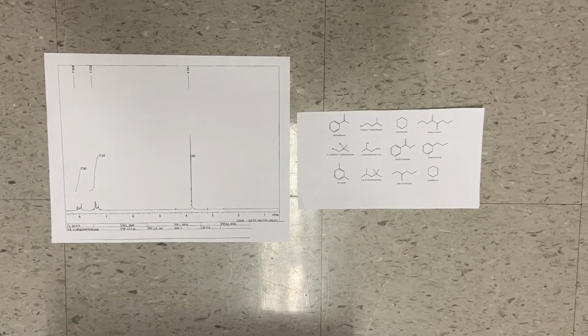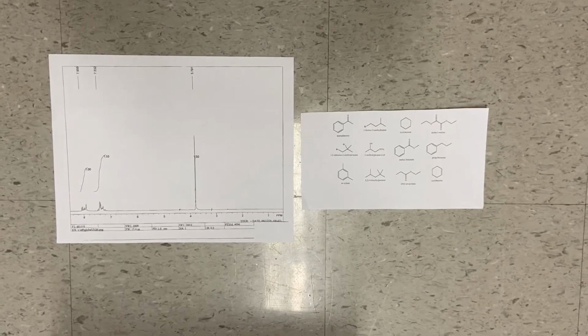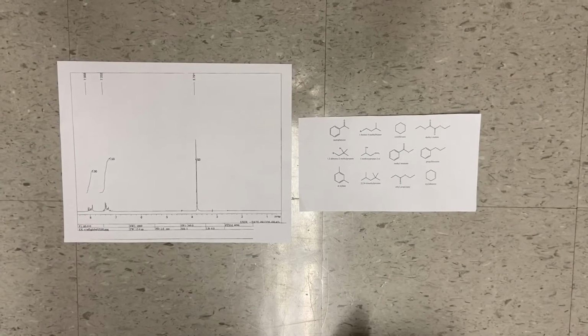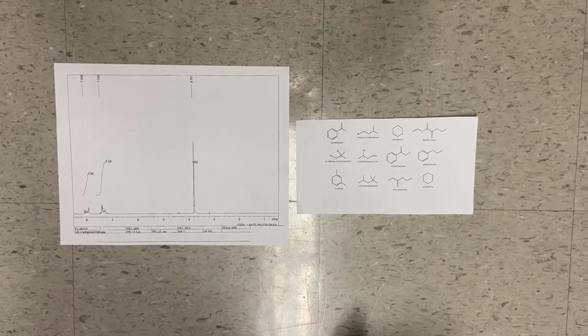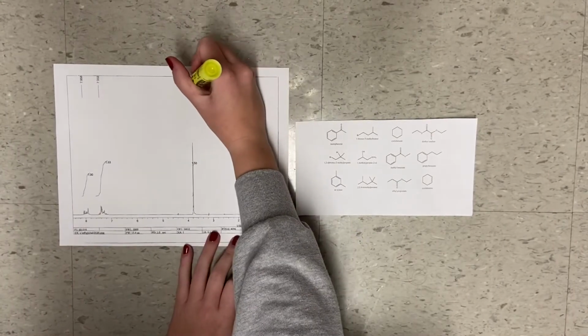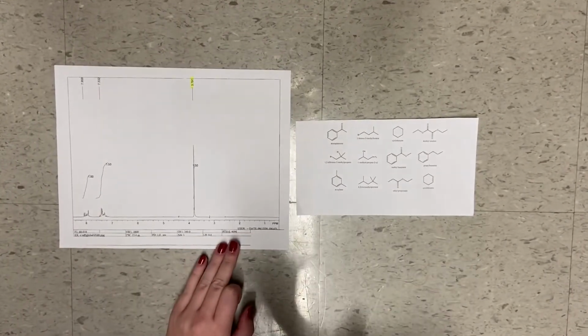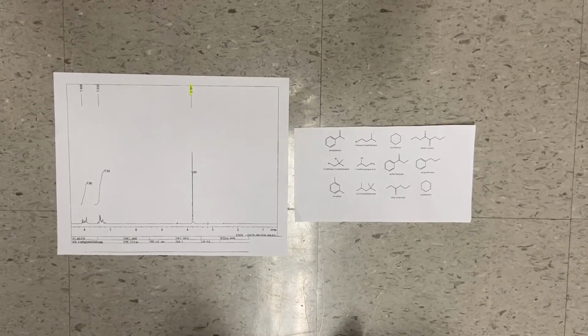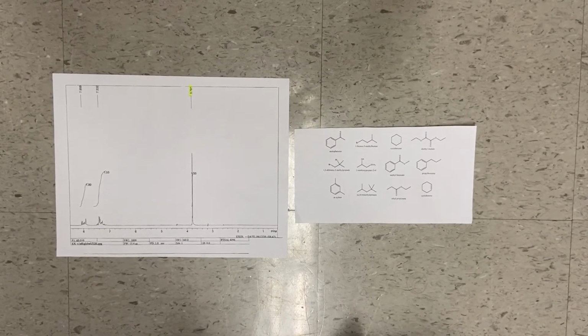The tube is then placed within the instrument to obtain the peaks and corresponding NMR values. The NMR spectrum depicts a distinct peak at 3.791 ppm. This falls within the range of 3 to 4 ppm, indicating there is an electronegative atom adjacent.